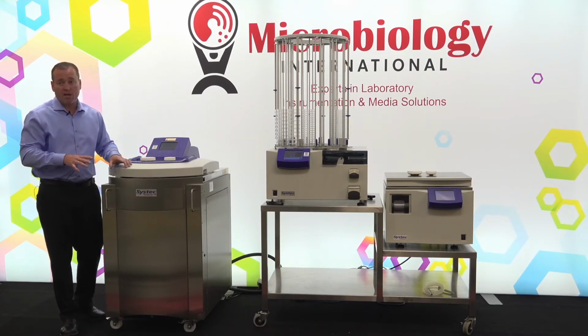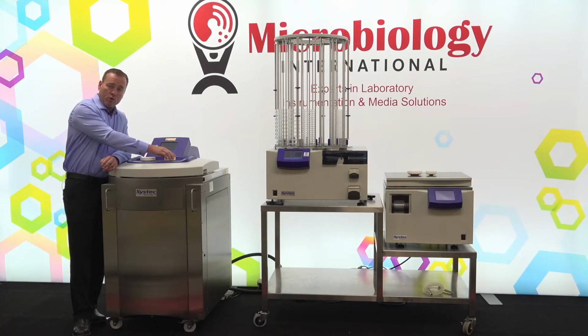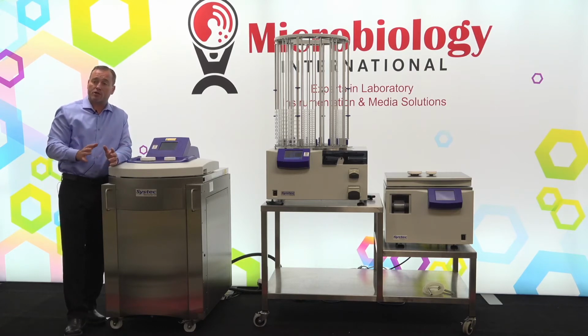When we start a cycle with any of our MediaPrep systems, it will go through a pressure test to verify that we have all of our ports closed before we actually put any pressure or start heating anything inside of the unit. So there is a test for that, and then we would do a water inlet to create the heating jacket before it starts heating to sterilization.